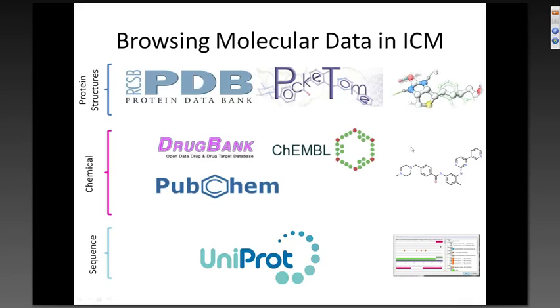You can also bring in 2D chemical information from DrugBank, ChEMBL, and PubChem. So DrugBank is a resource that combines detailed drug information data with information such as sequence, structure, and pathway. So it's a useful tool.